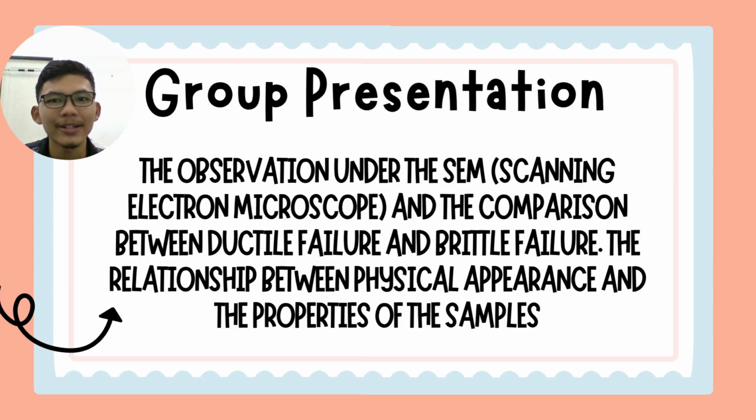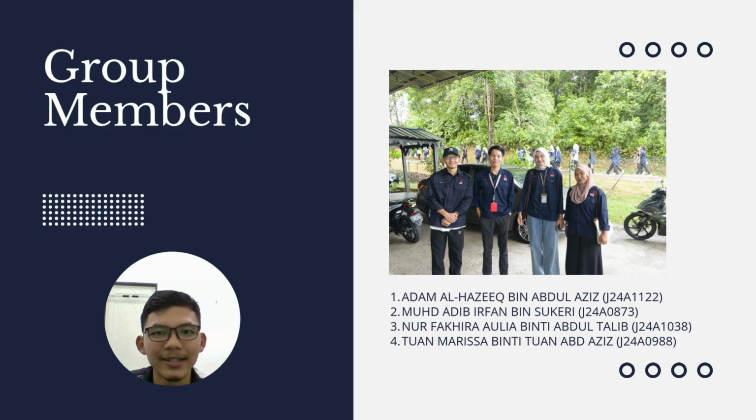J24A1122, and today my group will present about the observation under the SEM, also known as scanning electron microscope, and the comparison between ductile failure and brittle failure, the relationship between physical appearance and the properties of the samples. This is my group members.